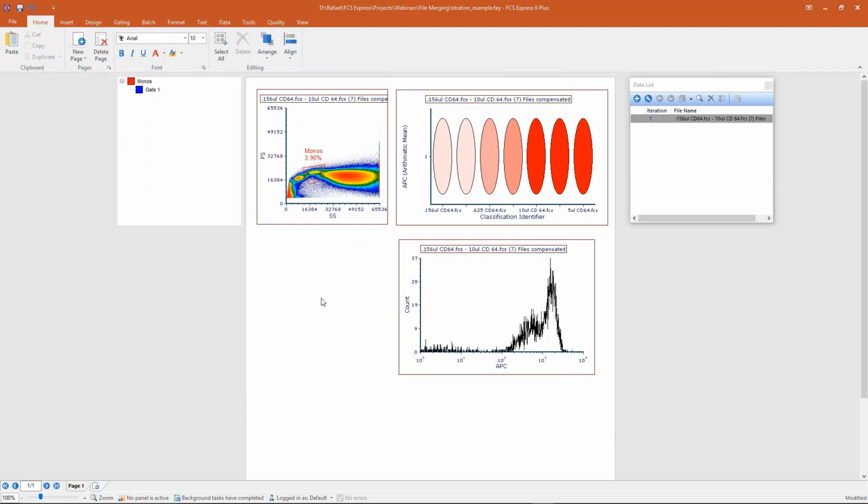And overall, it's just really easy to use templates with file merging and to utilize these virtual plates in our analysis for really normal day-to-day tasks, like quickly comparing between different samples across a parameter of interest, or for things like antibody titrations, which we might do on a more regular basis. File merging is a very flexible option, and with heat maps, it makes it much easier to pick out and compare those different types of changes within your data set.